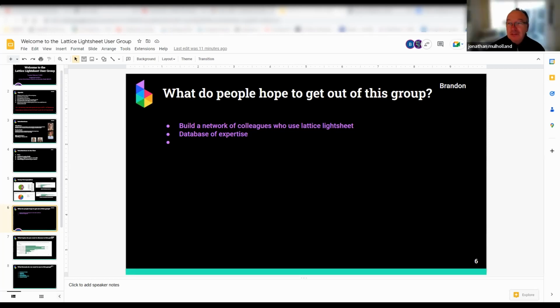I guess I'll go first then, break the ice here. For my facility, we're looking at support and help from a community of users for developing user resources, training manuals, support, etc., for getting users in the facility on the light sheet microscopes and getting good data off of it.